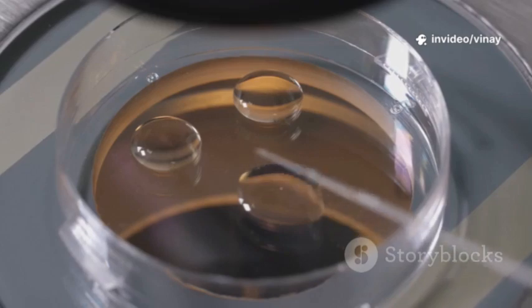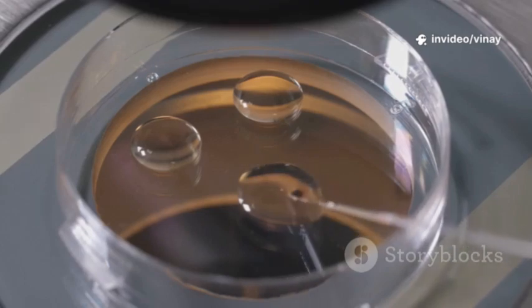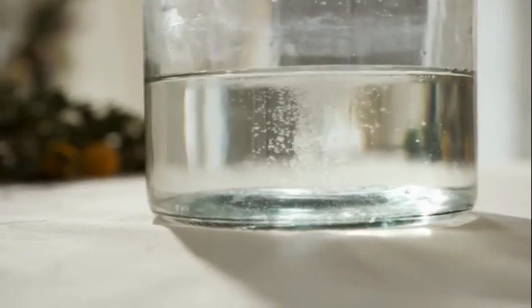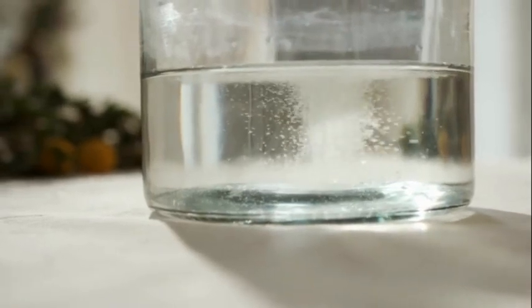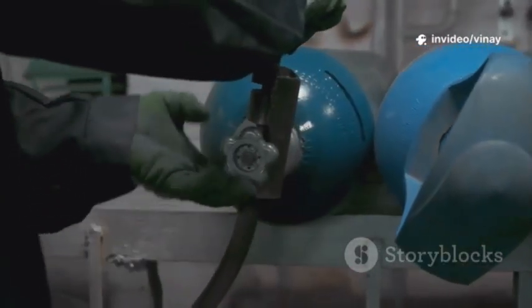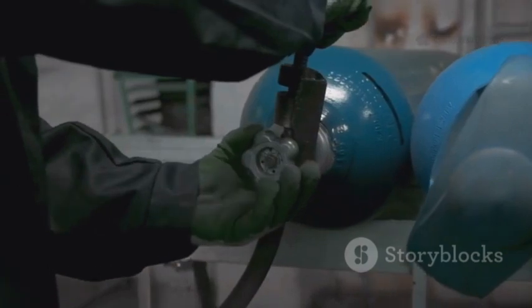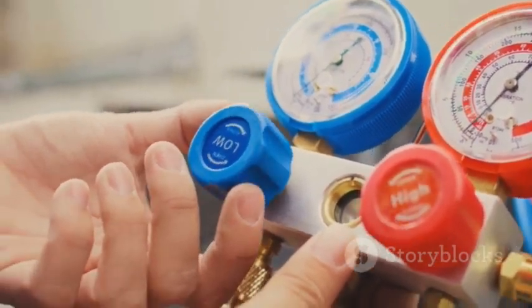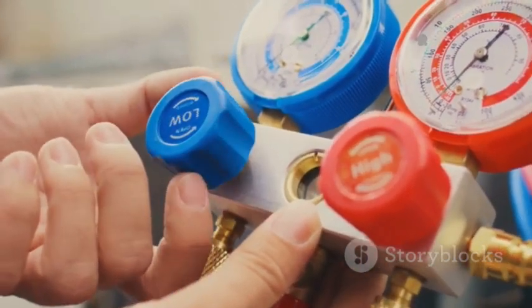The liquid is held in these pores by a force called surface tension. It's the same force that lets you slightly overfill a glass of water, creating a little dome on top without spilling. The liquid molecules are holding onto each other and the sides of the pore. Once the filter is thoroughly wetted, we connect it to a source of pressurized gas, like clean air or nitrogen. Then, we slowly, very slowly, start to increase the gas pressure on one side of the filter.